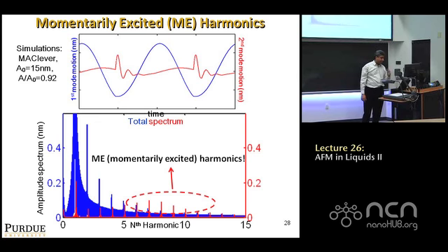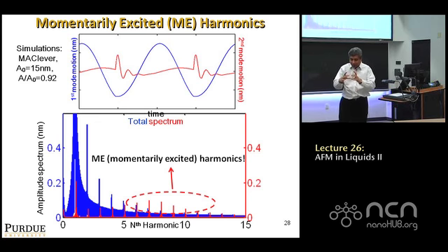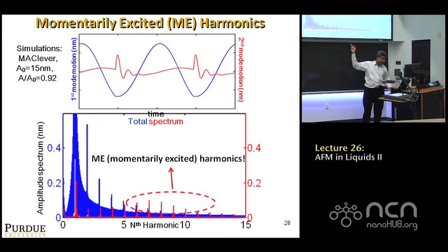So it suggests that if you're trying to capture this little ringing motion, what you measure is a combination of both, right? Because your laser spot is focused on the tip of the cantilever. The suggestion is that if you want to capture that ringing effect, you focus on these harmonics up here near the second eigenmode. Most of the signal you capture is going to be due to the red, not the blue, because the blue dies out and the red starts getting enhanced due to the resonance. So if you focus on these harmonics, you're likely to capture the ringing, and if you capture the ringing, you've got a metric for measuring local property variation.